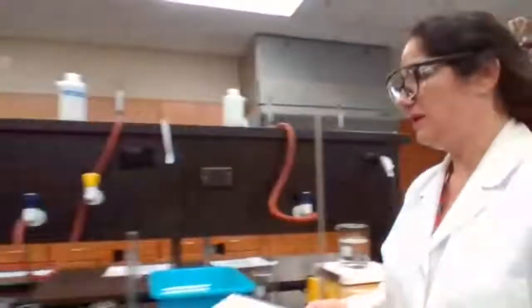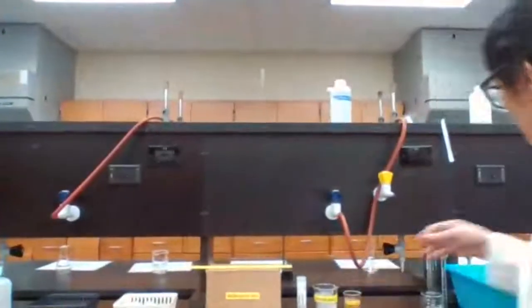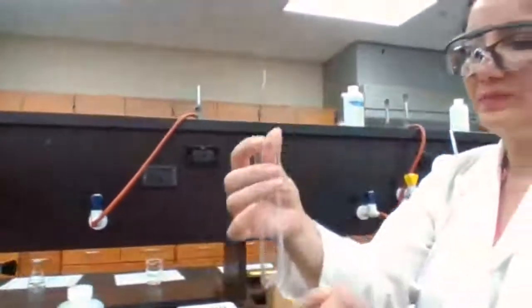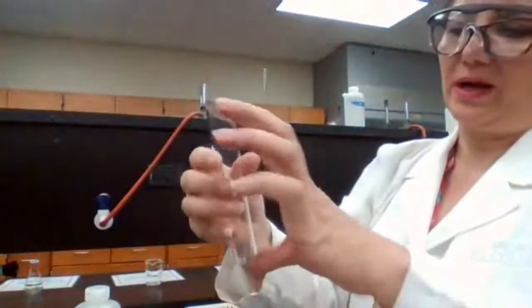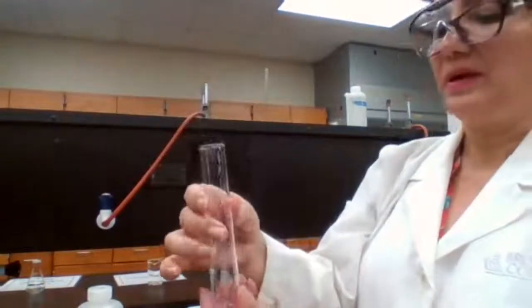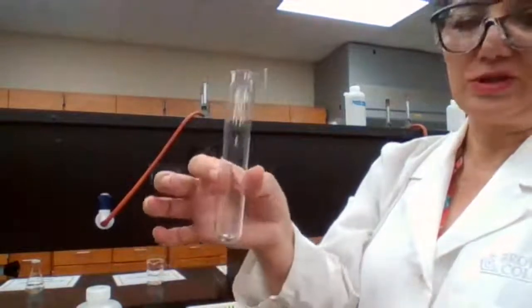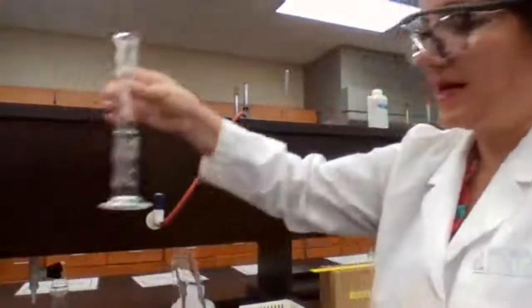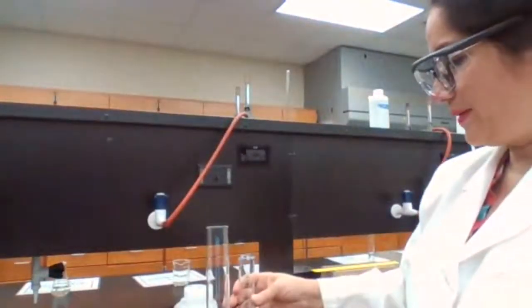Okay, part 2-2, determine the volume of a test tube. To determine the volume of a test tube, we take a test tube and fill it up with water and see how much it is going to hold. So this is the test tube. It's not a perfect cylinder, so we can't measure the height and the area to find the volume by calculation. So in order to find out how much water it is going to hold, there are two ways we can do this.